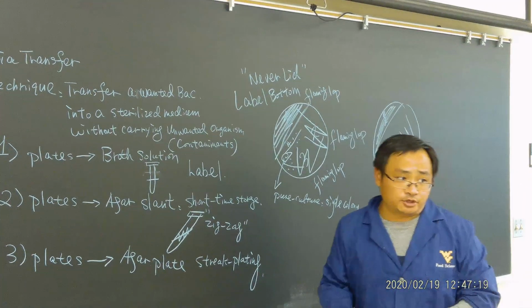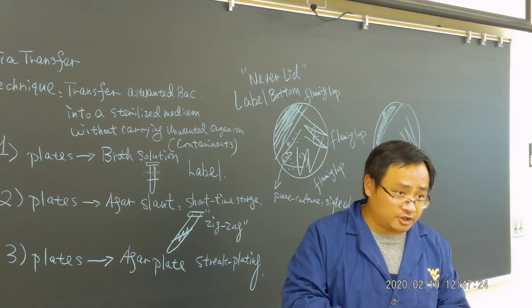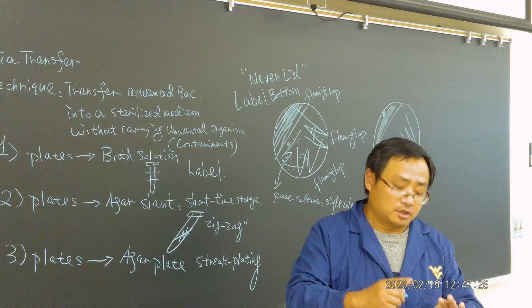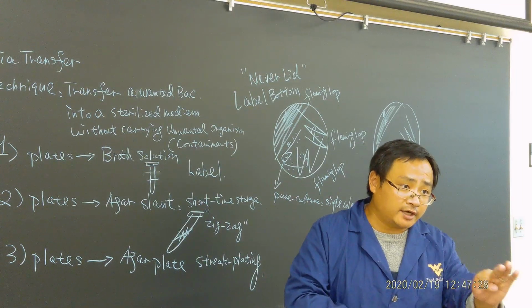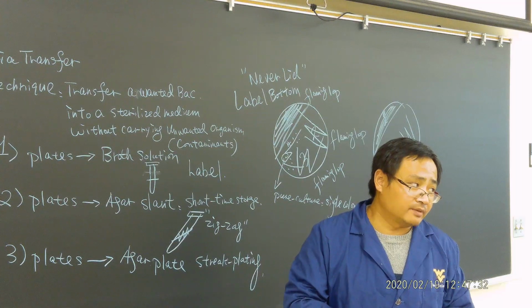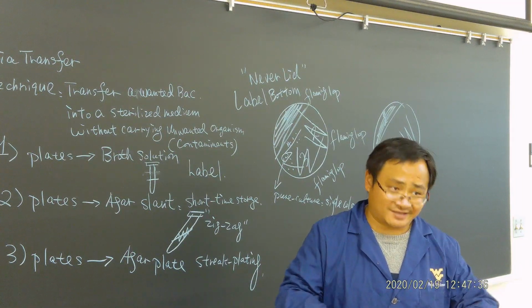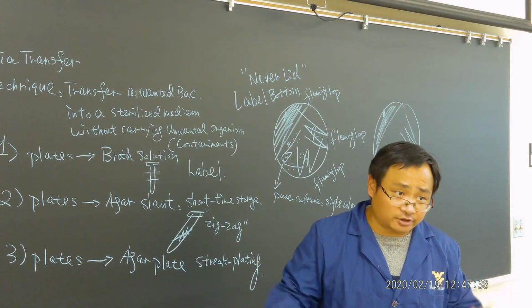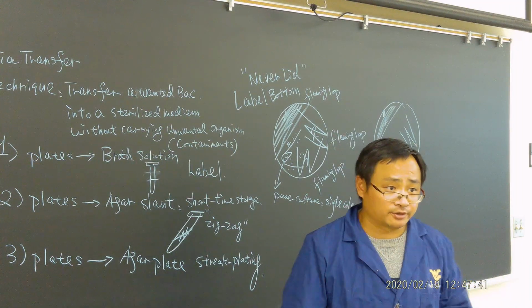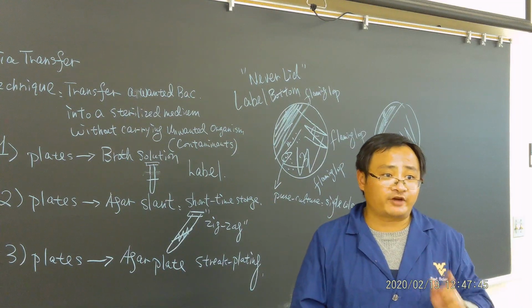So what information are you going to put there? Your name, batch number, of course initials. Batch number, and what kind of bacteria you put there. If E. coli, you write EC. Bacillus, you write BS. Staphylococcus aureus, you write SA. And then the date. Now the bottom line is next Tuesday, you can find your plates.